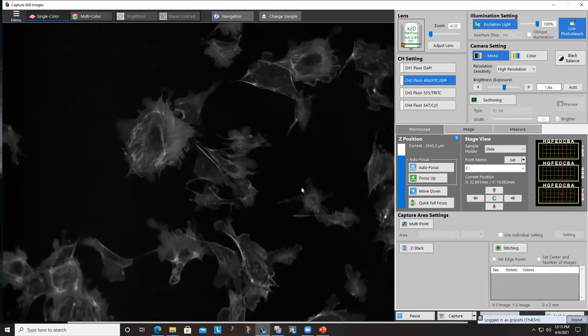So what I was talking about, different samples and different imaging parameters, is, since your goal is to compare the fluorescence intensity following transfection between samples, I would not recommend changing the intensity at all, or changing the imaging parameters at all. The only time you want to change the imaging parameters is, let's say you acquire everything and then you want to show some of your cells at a higher resolution. At that point, change the imaging parameters to make your cell look nicer, just for a pictorial purpose. But when it comes to analysis purpose, don't do that.